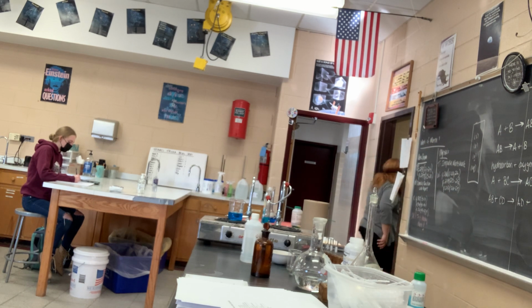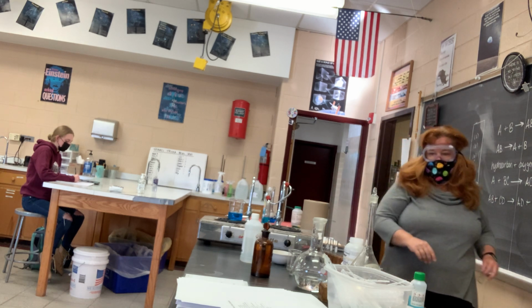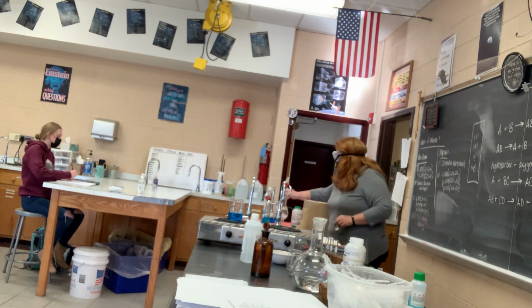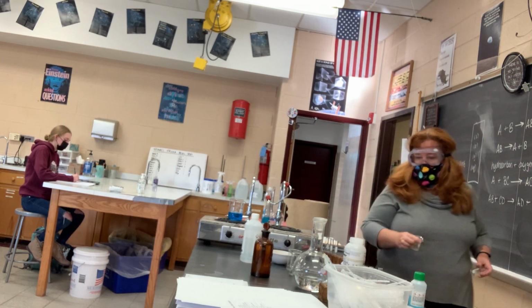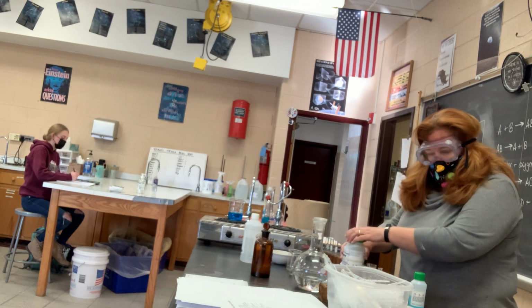Need another beaker. It says sodium chloride. I'm getting rid of this. I need sodium hydroxide, which I didn't bring out here.